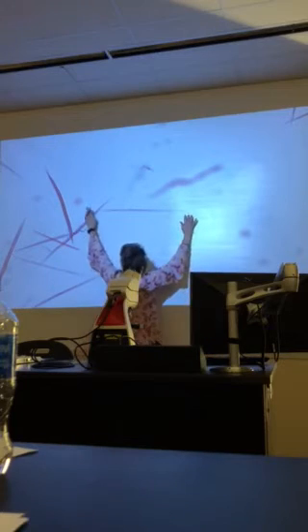All right. So then I have these little guys. So what tissue am I looking at? I am looking at xylem. Okay, so I'm looking at my xylem here. Now, what are my little tiny cells that I see that are very long and narrow and tapered at the ends? Those are just my fiber cells, okay? Those are fiber cells.